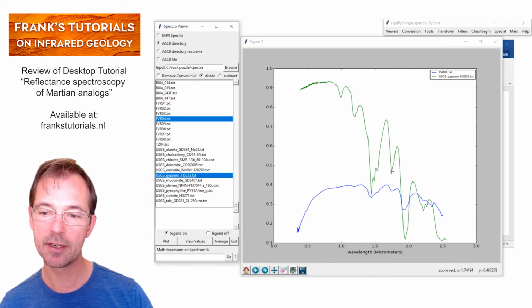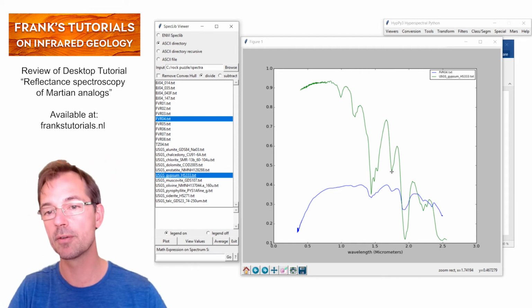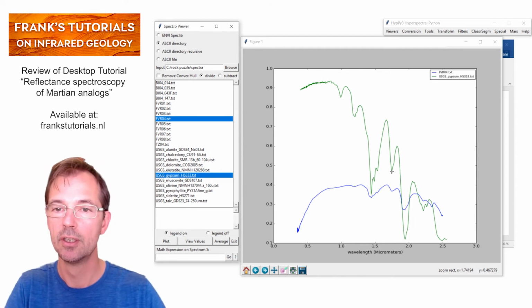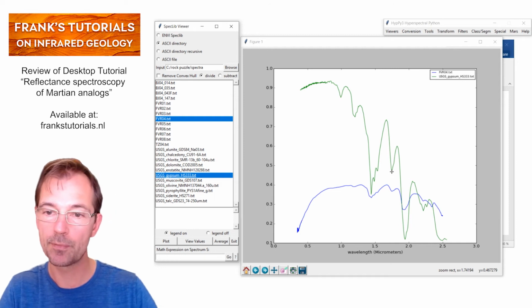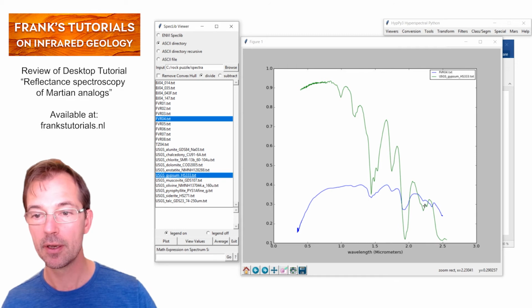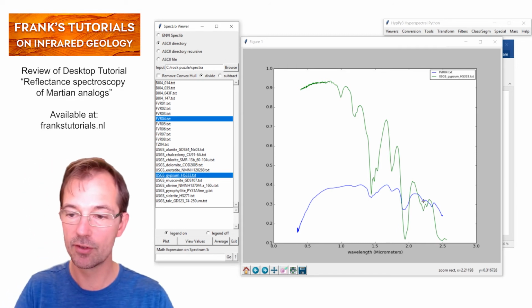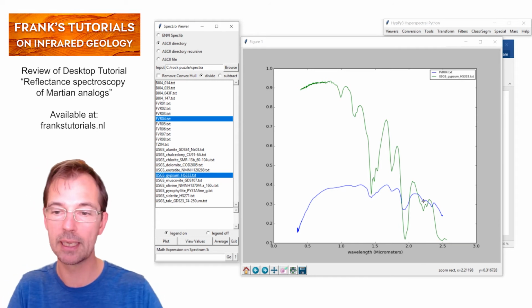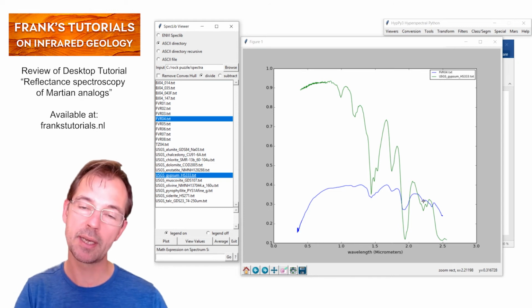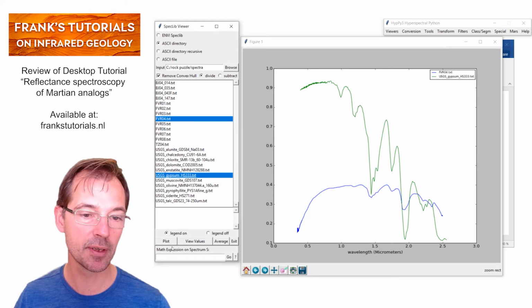This feature here at around 1.74 is also typical of gypsum, and it occurs with some variation in other sulfates as well. But you can see that it's also present in the unknown spectrum. Then there's a feature at 2.212 more or less. That's also matching. So because of this, we can be quite sure that we have a very good positive match.